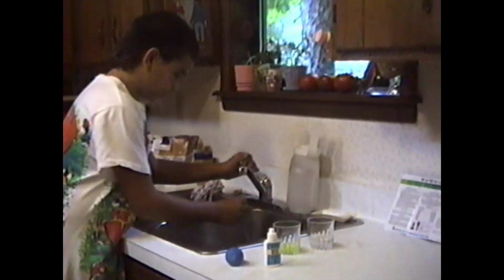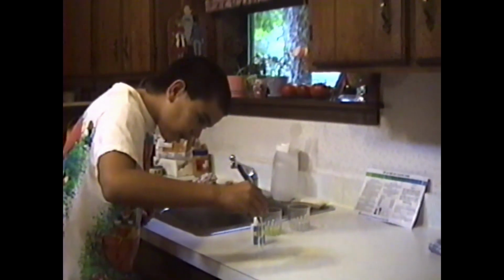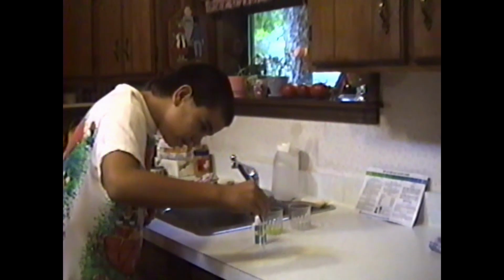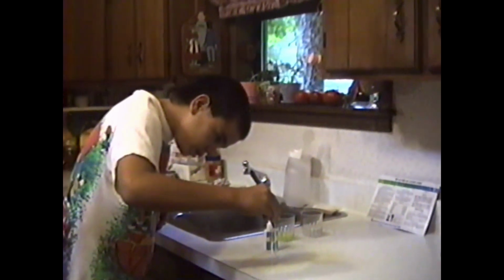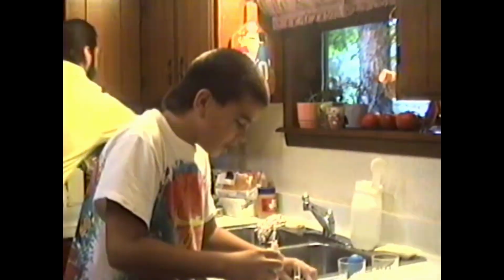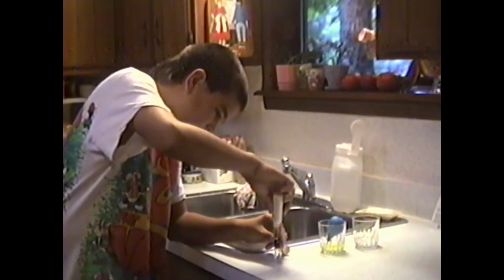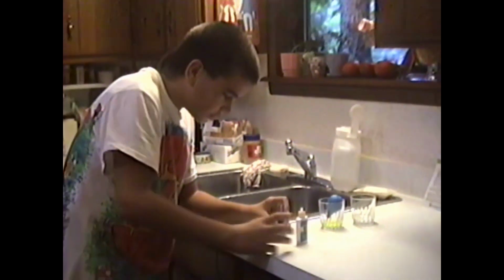So I will fill this up with water a little bit, and I will take this little dropper and put 1, 2, 3, 4 drops in. Drops of what? Ammonia, yeah. And take 1, 2, 3, 4, 5, 6 drops of indicator solution.